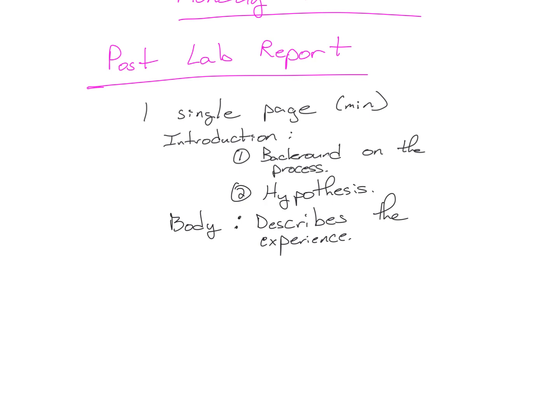Did the temperature make a difference? We're not sure. Was the salt concentration different? Why did it turn yellow? Could have been the lavender oil. Why did my colleague flip the test tube on its side and let all the gas out?